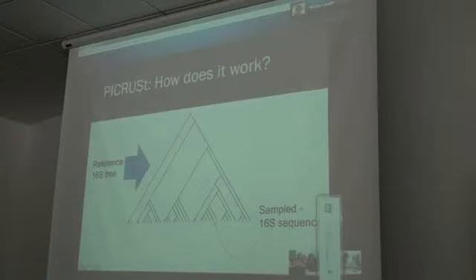And then from your actual microbiome sampling with 16S, you would get reads, and you can assign these reads to tips in this tree. And that's what is called closed reference OTU picking in the QIIME world. So you can associate a 16S sequence with each of these tips.